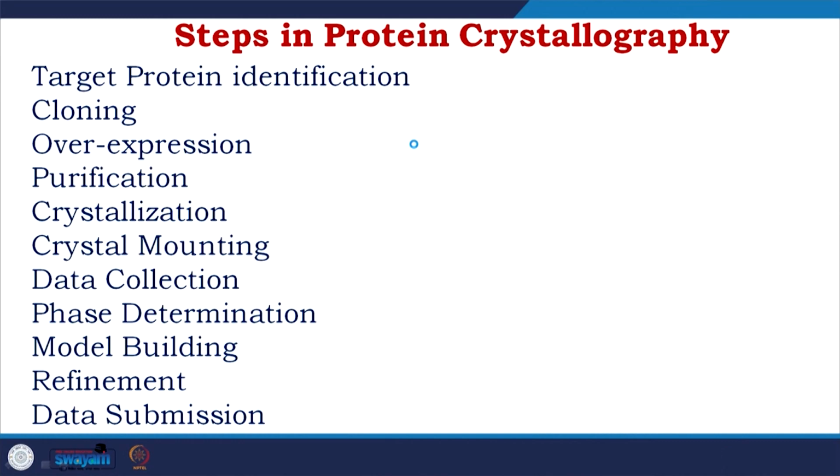Then once you get the amplitude and get the phase, you will go for model building. Initial model building is not enough, so you go for further refinement through energy minimization and all. And once you have the refined model, you will check the quality, and ultimately you will do the data submission.